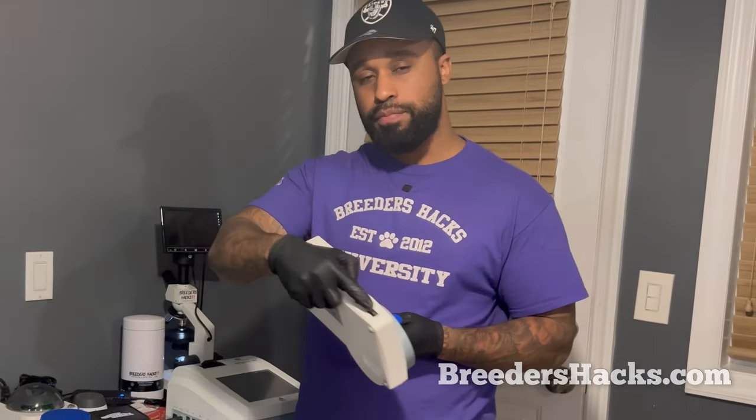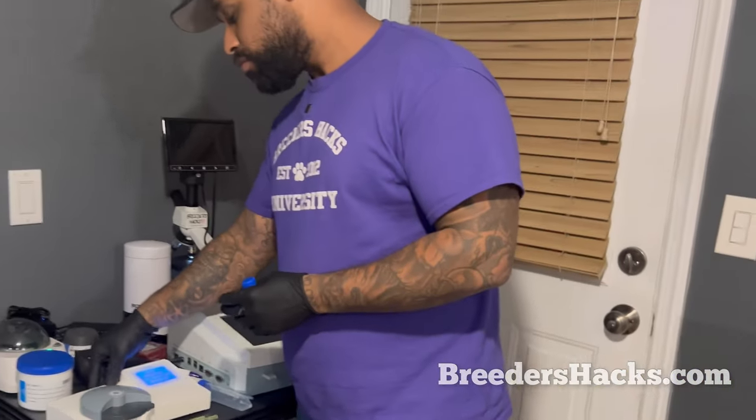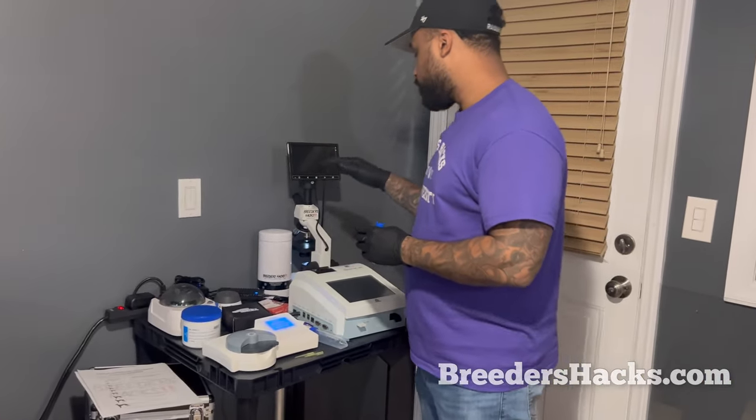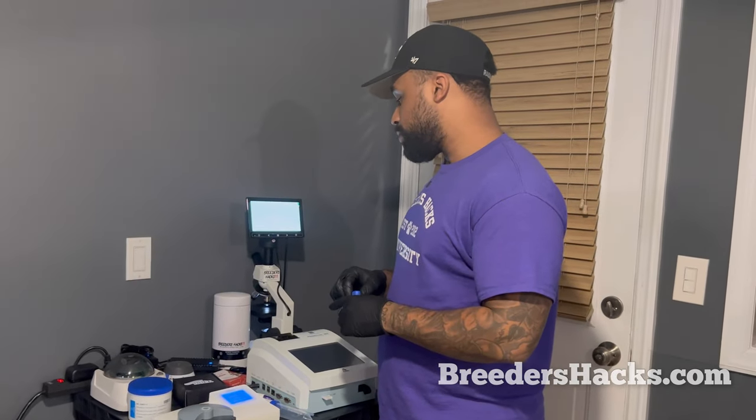And you're gonna turn it on. There's a power button right behind it. You're gonna turn that on. It's gonna power this thing up. As that turns on, you'll turn on your microscope. And we're just gonna do both of these at the same time, basically.